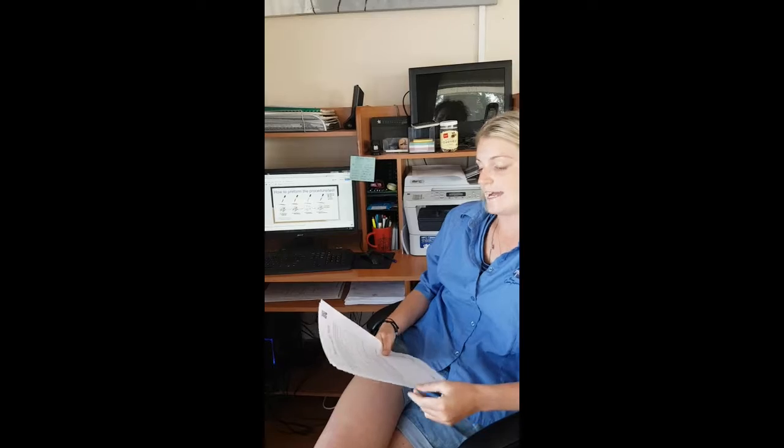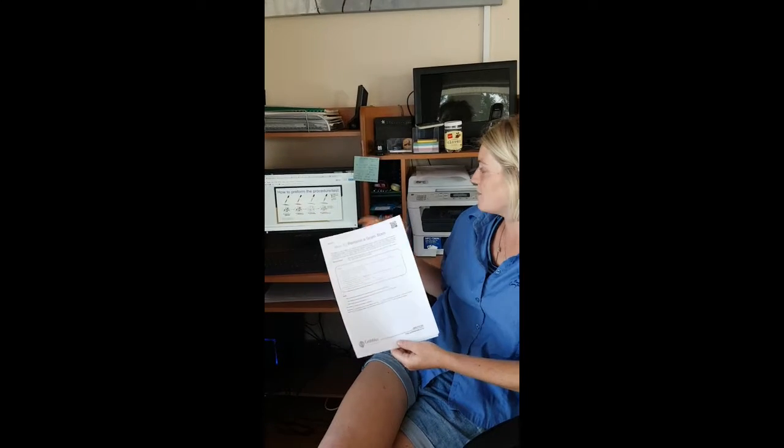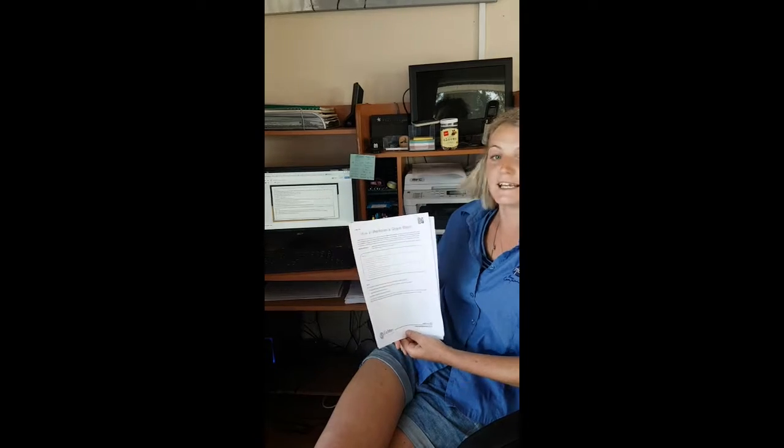Next, we've got how to perform the procedure or test. Here I've just got a wee picture of steps 1 to 4, and I've also printed out how to perform a gram stain, which I've listed in the next slide, which tells us the method and results.